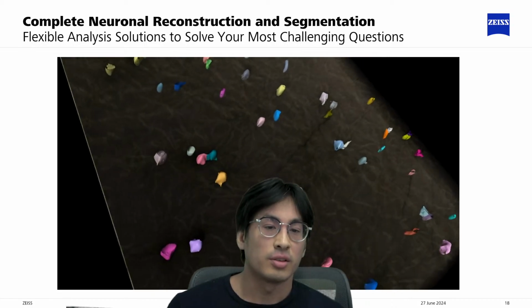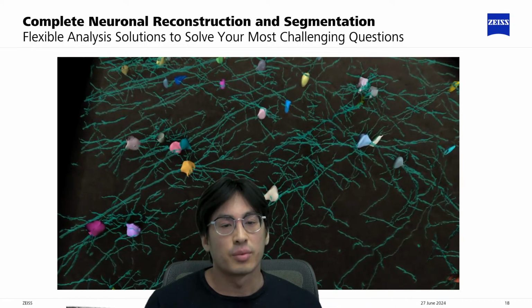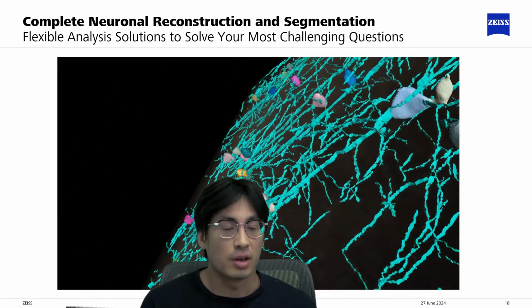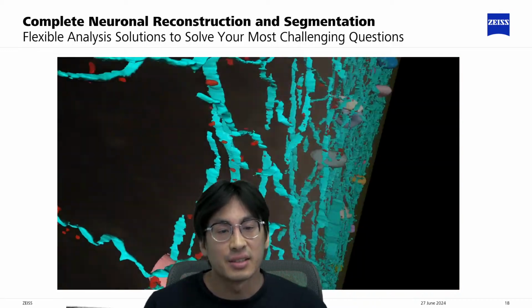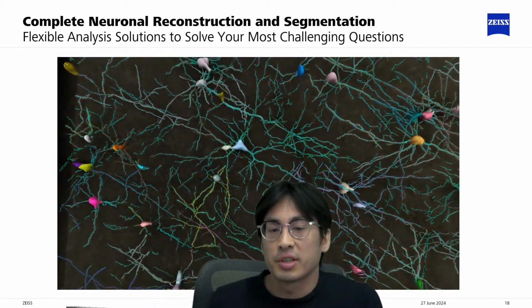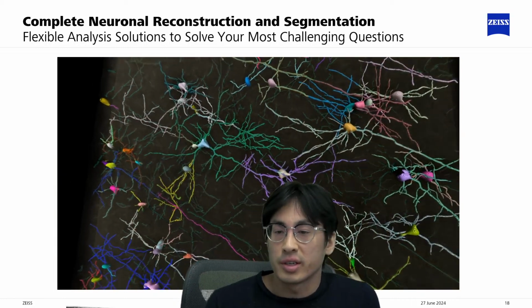So all in all, using ZEISS's arivis Cloud AI platform and advanced image analysis software, arivis Pro, you can analyze, interact with, and render your results for publication-ready materials quickly and easily.